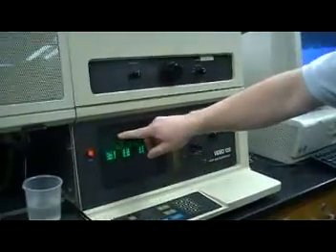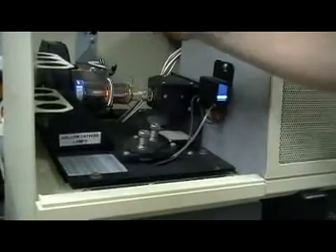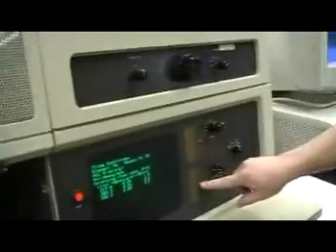So the 5 milliamps, we need to set this to 5 milliamps, and so if you open this up, I told you before that you can change the intensity using this knob right here, and so you adjust this knob until we have a current at 5.